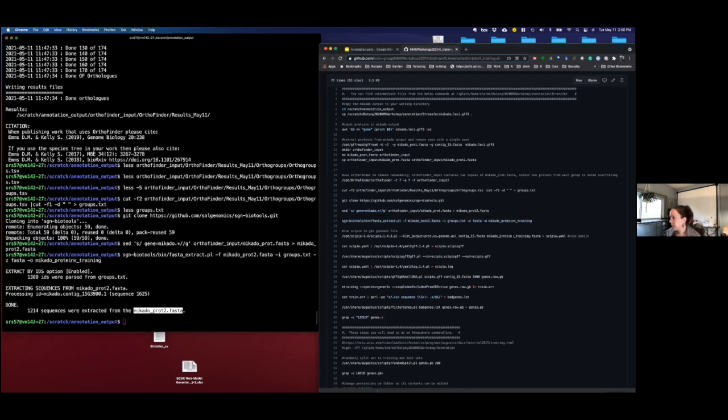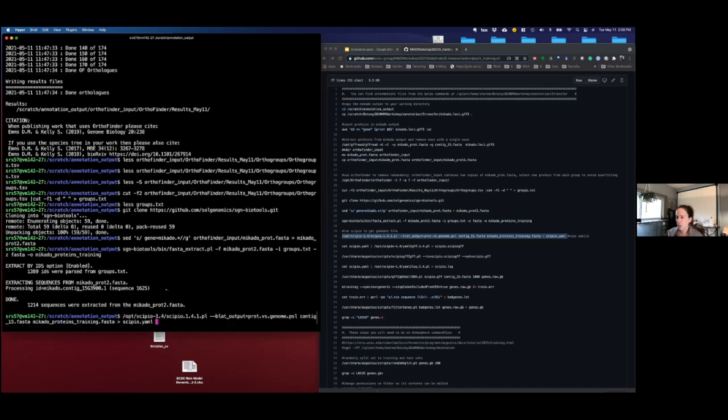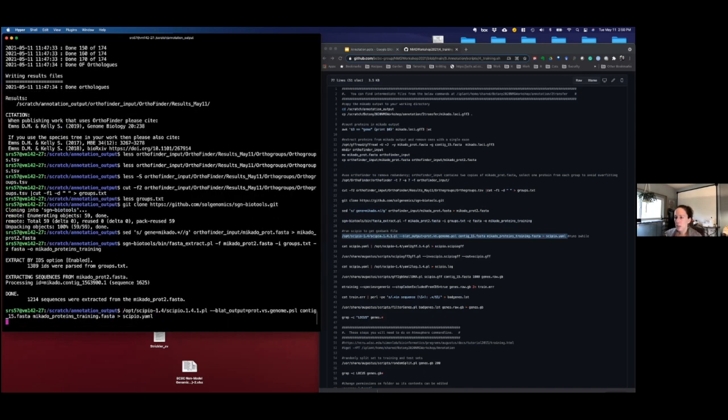All right, so this step takes a while. So I think while this runs, I'm just gonna talk you through the rest of it since we're getting close to time here. But this is probably gonna run a good 10 minutes anyways.